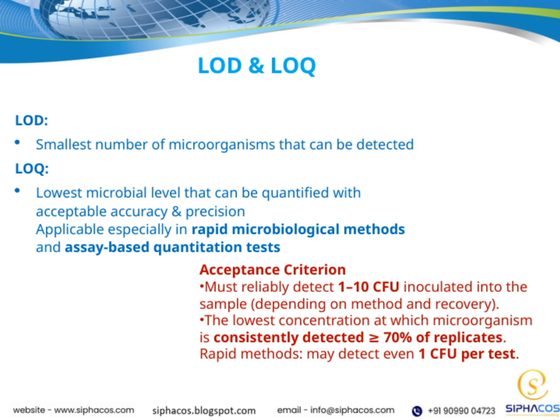This ensures that our method isn't just occasionally picking up the microorganisms, but is reliable enough for practical use. Now, when it comes to rapid methods, they can sometimes detect even just a single CFU per test, which is quite impressive and useful for quick screening.